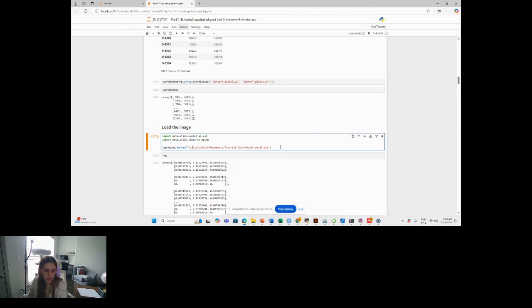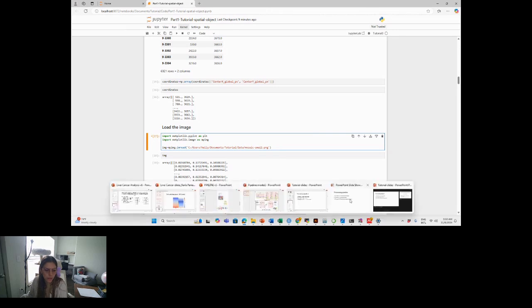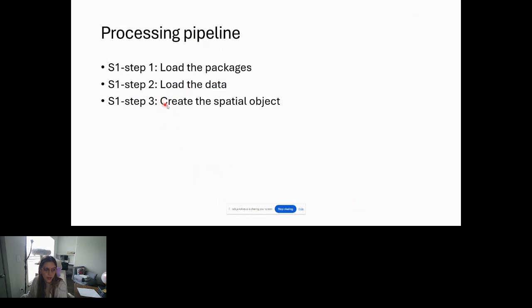You can go back also between the slides so that they can see what's going on, right? We already covered the first two steps. And now we need to load the packages. Even though you already have the libraries, you're still within the script. As you know, in the case of Python, you load your packages. The second thing is that we load the data. From this data, we have the raw data and we have the data that is derived from the raw data that is provided by NanoString. Those are the first data sets that we are loading.